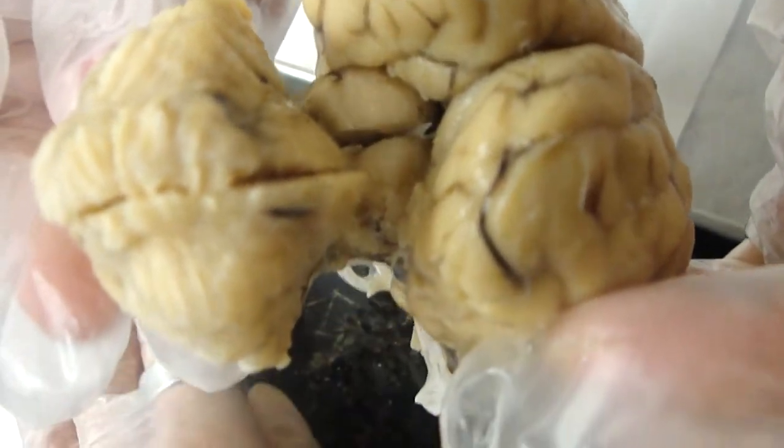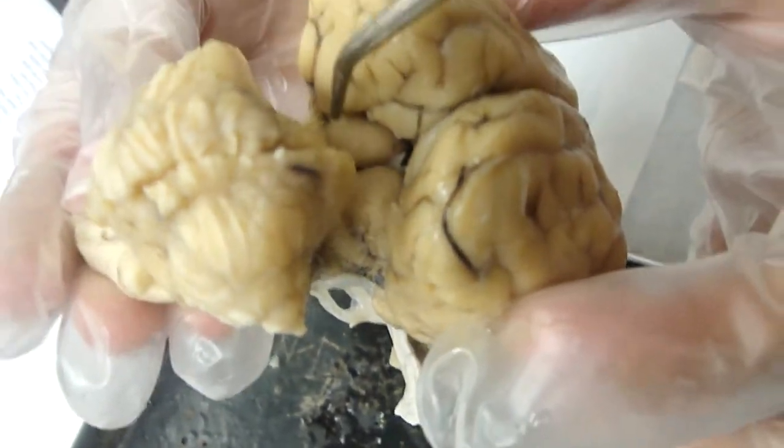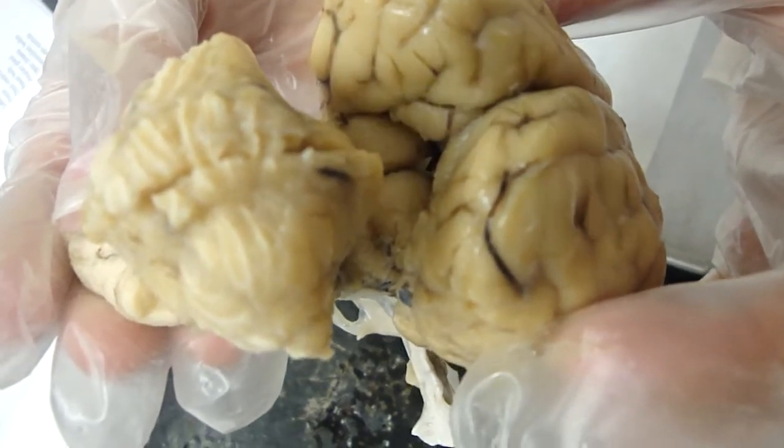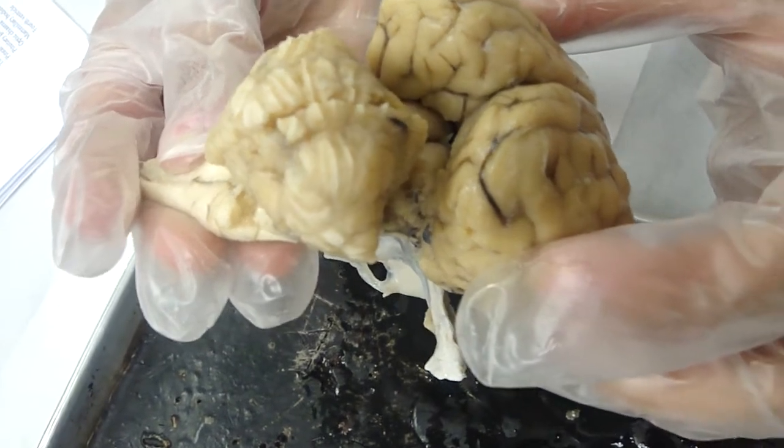Back to our sagittal section here. Each brain has a couple of structures that we'll look at first. This may be very difficult for me to show on the camera, but we'll do the best we can.